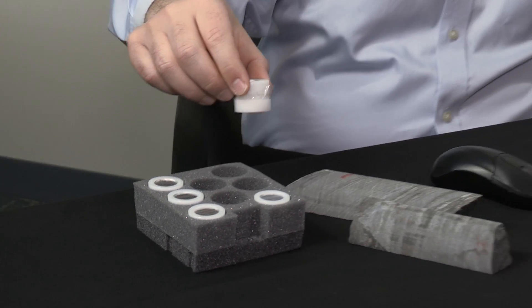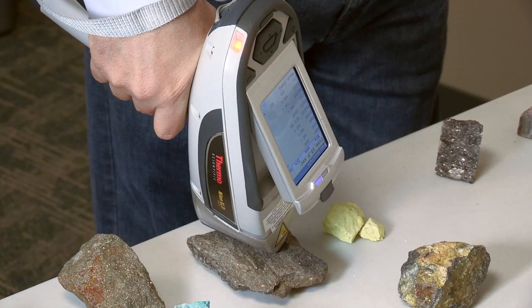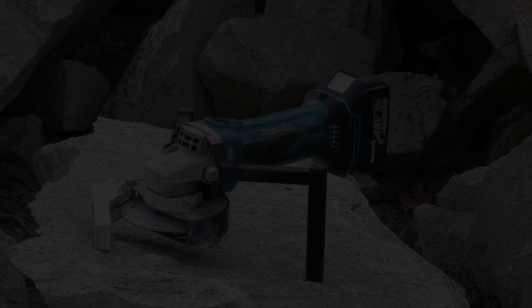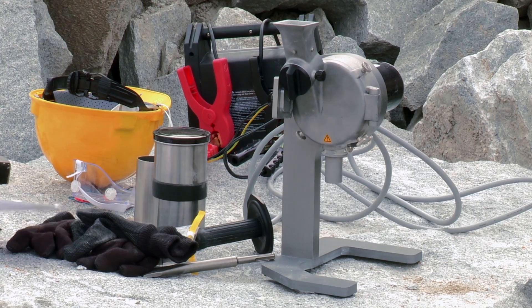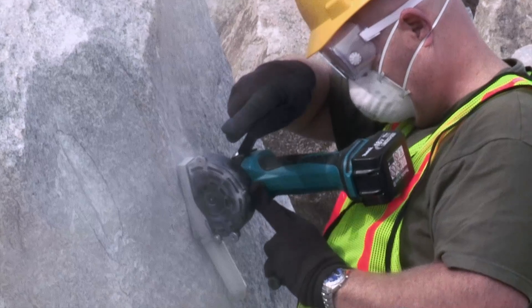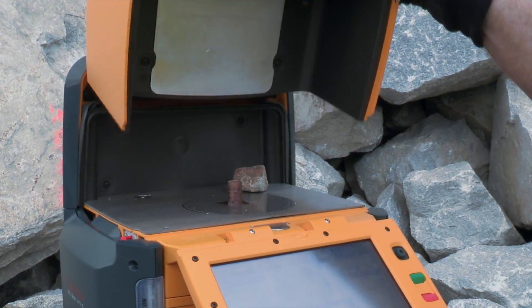But even we recognize that sampling techniques can greatly impact those results. In our continuous efforts to help bring the lab to the field, we are pleased to present the first-ever Thermo Scientific mining sample collection and preparation tools. These compact, portable, battery-powered tool sets provide everything you need to perform elemental analysis of geological materials on site within minutes rather than days or weeks.